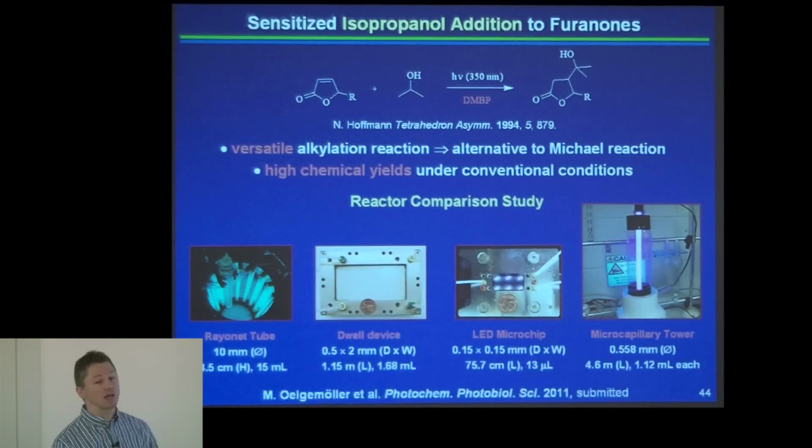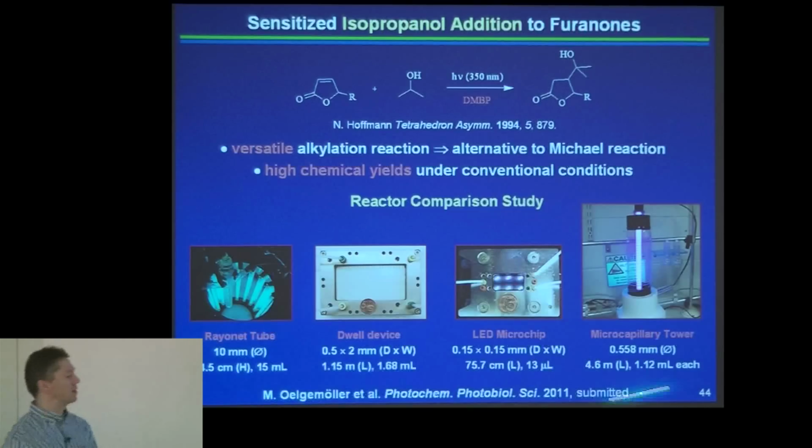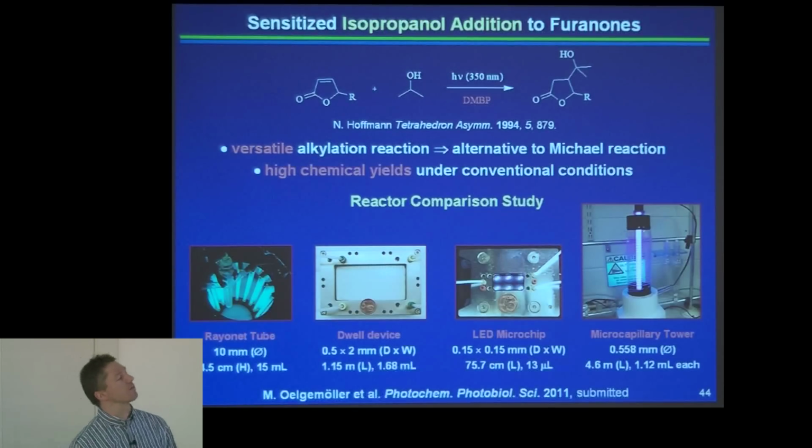Nevertheless, this is made out of scrap material that we found in the lab. This is almost a Hyakuen reactor, with the exception of the syringe pump, of course. Here are the dimensions that we need to compare. And this is the reaction that we did.